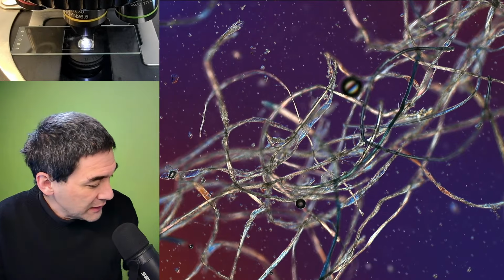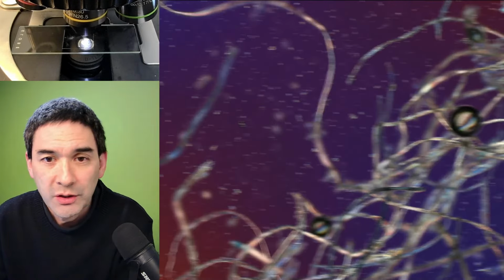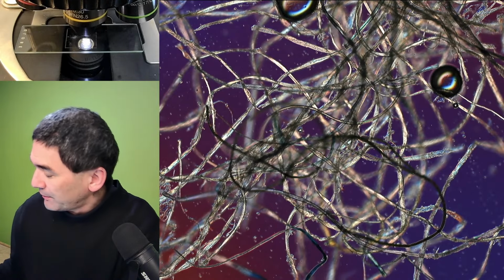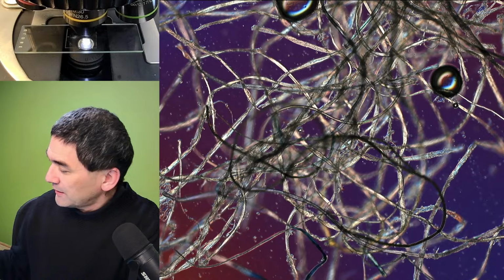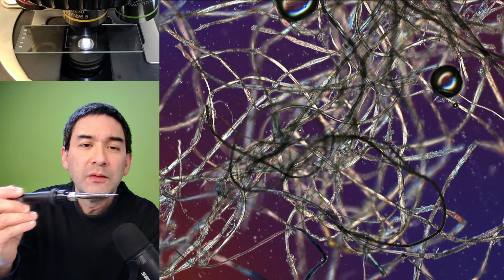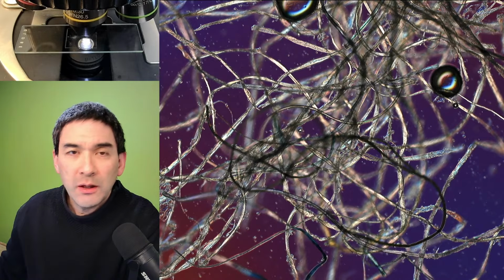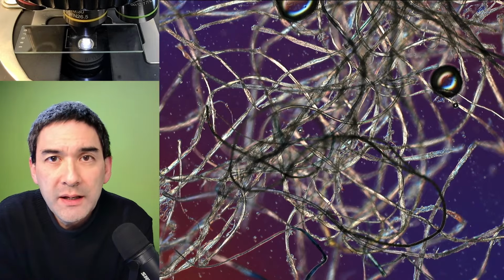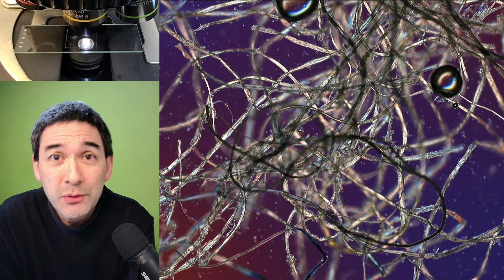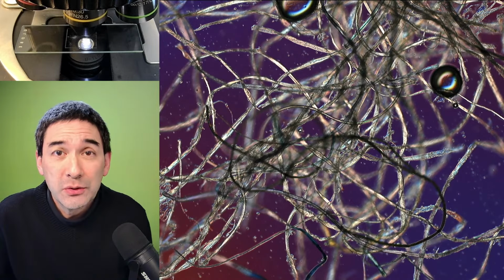So what I've got here is some synthetic fibers as well that we can look at, and I've got some dust samples. I've also got something already set up, and this is a soldering iron, 300 degrees, with a very sharp pointed tip. With a soldering iron, you're able to test whether a microscopic fiber is synthetic or natural, because synthetic fibers are able to melt, and hopefully we'll be able to see that.